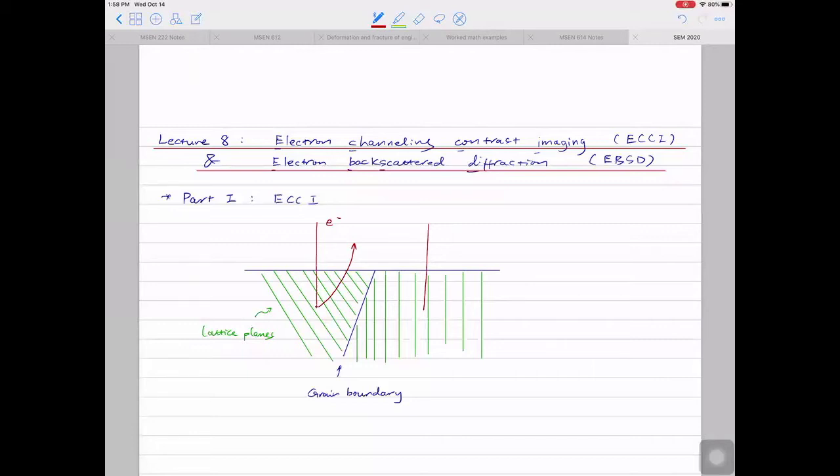I think deeper, because between lattice planes, there is less force. Sorry, did you say deeper or shallower? Yes, deeper. Great, you're exactly right. The electron will travel deeper in the material before it can scatter. The reason is that now you have these lattice planes aligned in the same direction as the electron beam. The empty space between the lattice planes acts like channels. So that's where the word channeling comes from. The electron on the right can channel deeper into the material.